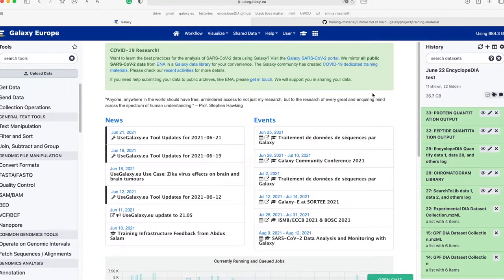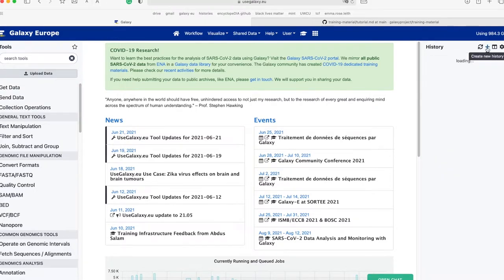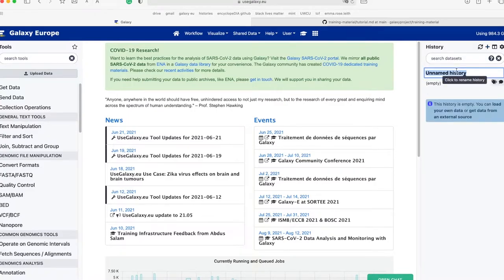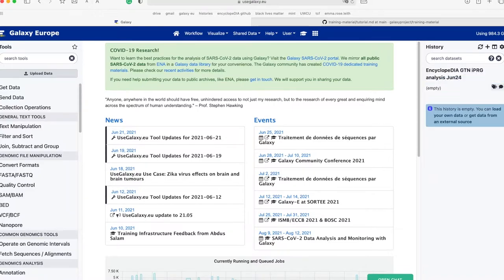The first step in running the workflow is to create a new history. To do this, click on the plus sign in the upper right corner of the screen. Once the new history is made, give it a name that is informative on the workflow being run and the data being analyzed. In this case, I am going to name the history 'Encyclopedia GTN IPRG Analysis, June 24th,' as I always like to add the date to my history title.